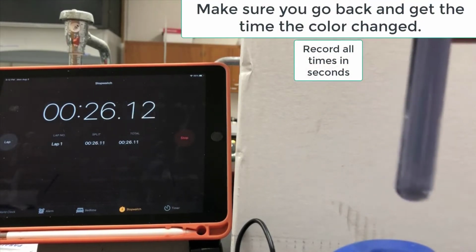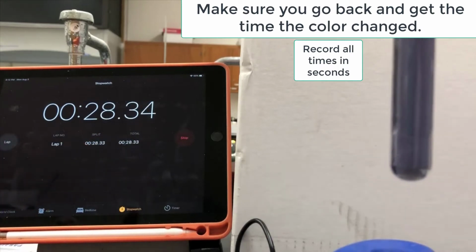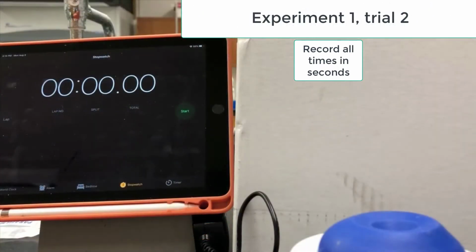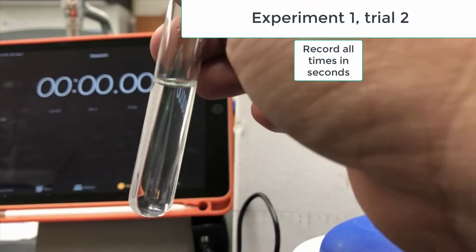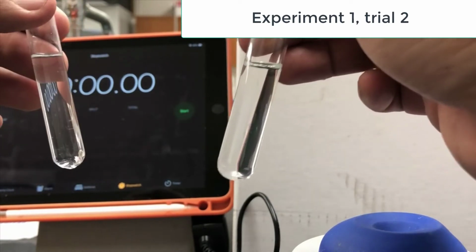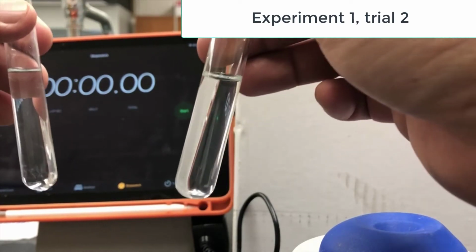It's 24 seconds roughly. Well, you'll have to go back and pause when you see that color change, okay? So this is trial 2 for experiment 1, and if the times are close enough, we'll go ahead and stop there and go on to the next experiment.